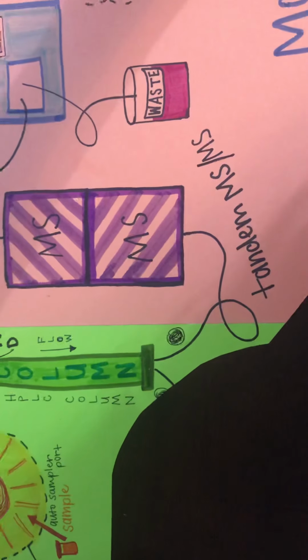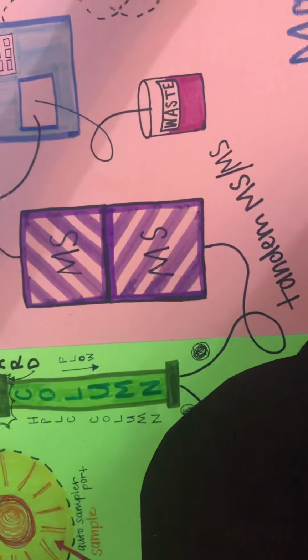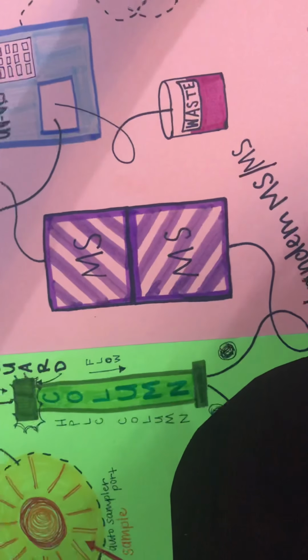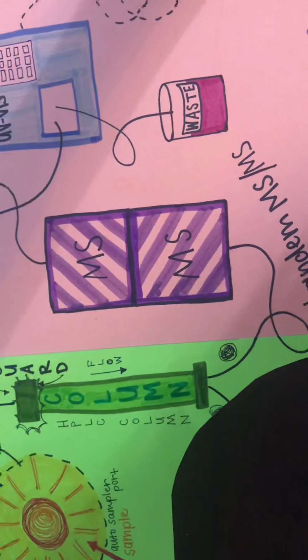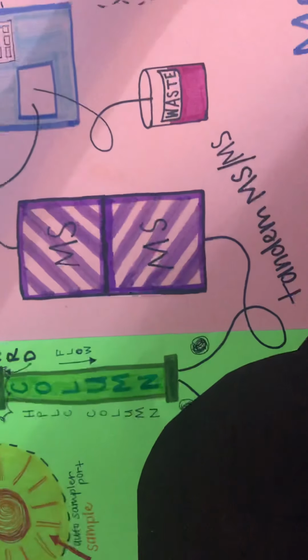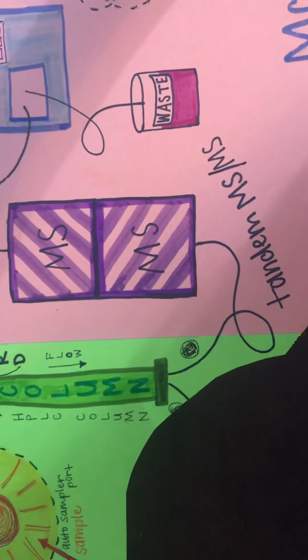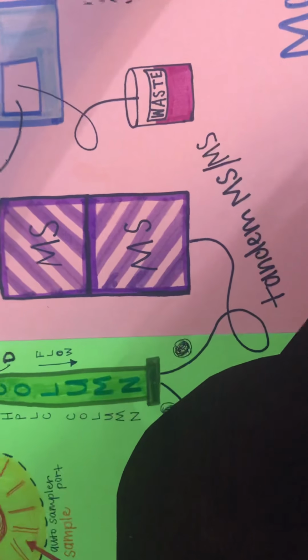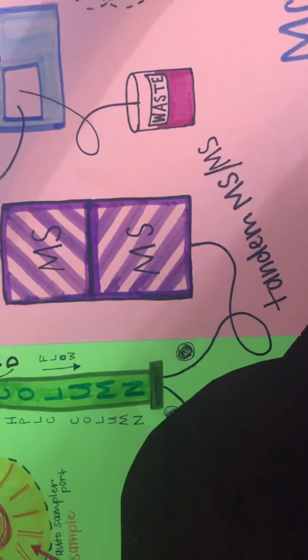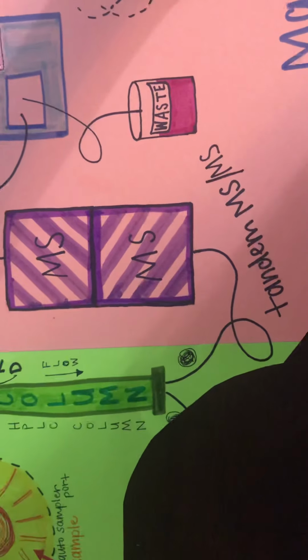So to get different fragmentation for our mass specs, we use different ionization methods. Usually we use electrospray ionization, which is a soft ionization method, so that the compounds can be analyzed coming off the HPLC first and not instantaneously fragmented. A less common ionization method is the electron impact method, which is primarily used in GC because it fragments the parent ions before it gets to the MS, which is not what we want. We want it not to be fragmented before it gets there.